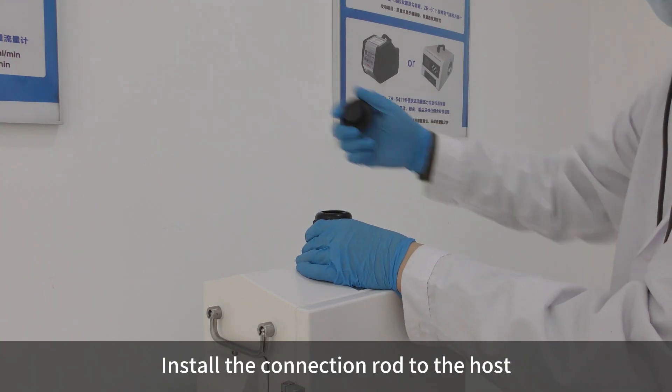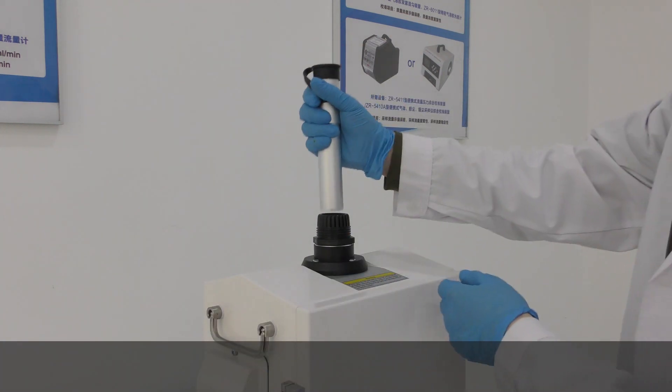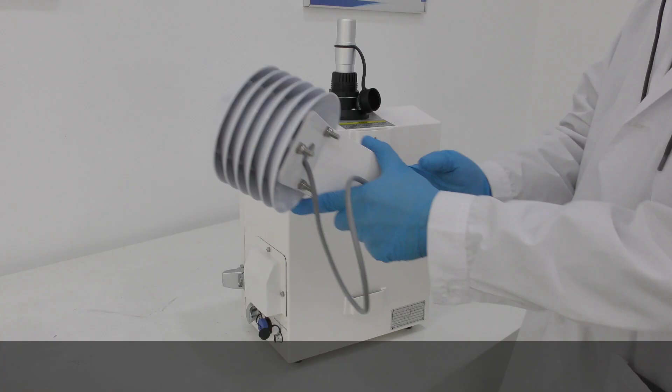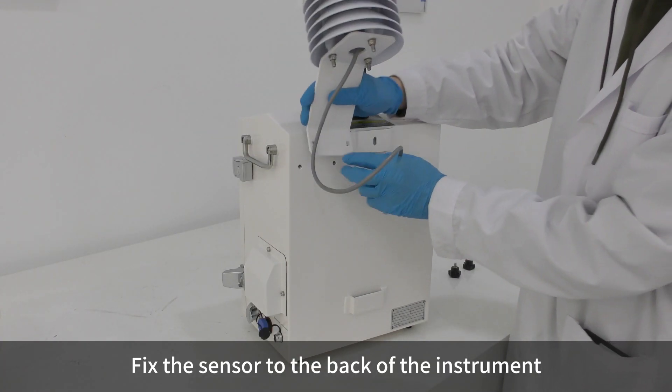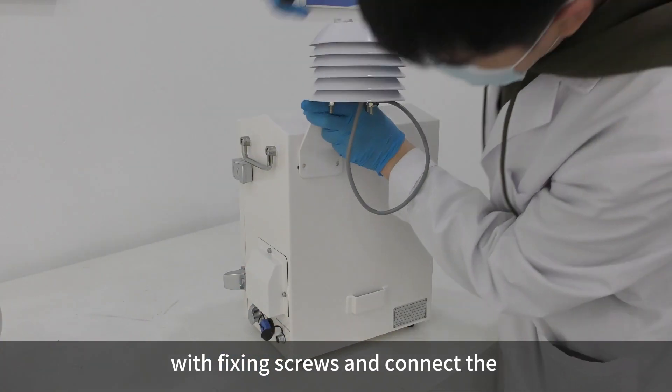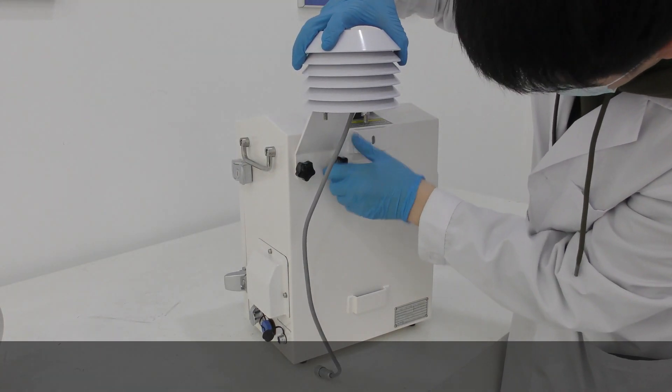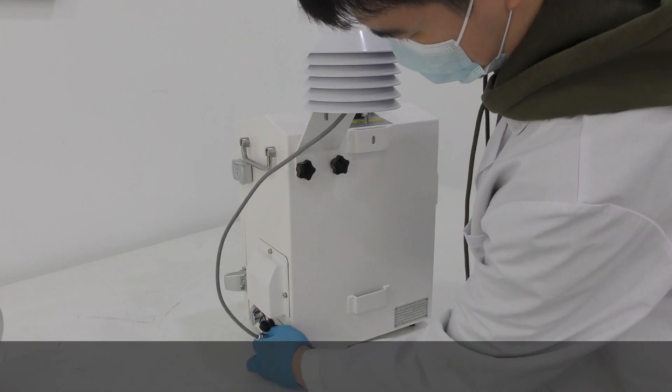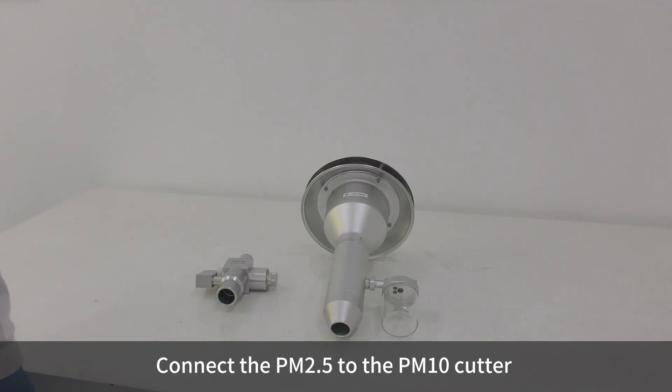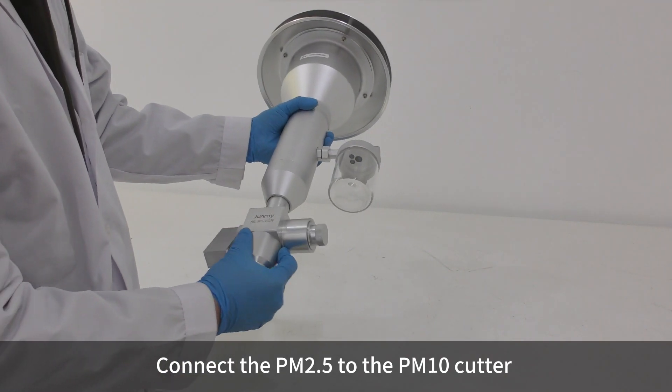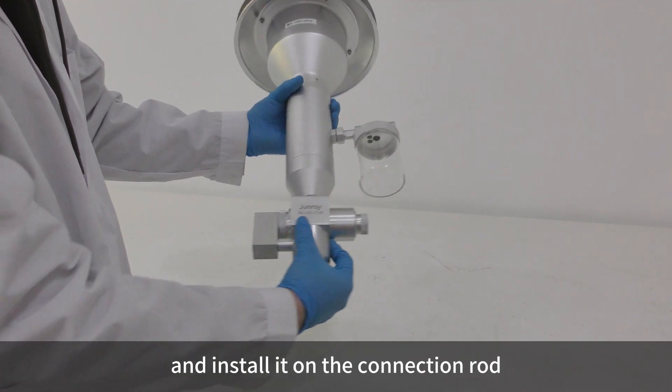Install the connection rod to the host. Fix the sensor to the back of the instrument with fixing screws and connect the communication cable. Connect the PM 2.5 or PM 10 cutter and install it on the connection rod.